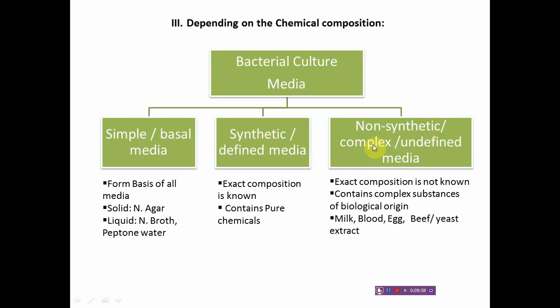Complex, non-synthetic and undefined media. Here the formula is not known. The ingredients are basically from complex origin. Complex substances from biological origin, such as milk, blood, egg, beef or yeast extract, are included in the medium as complex ingredients.